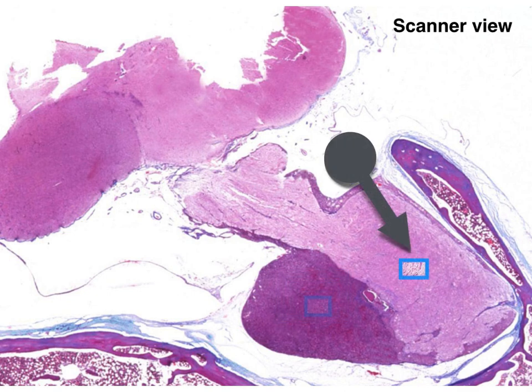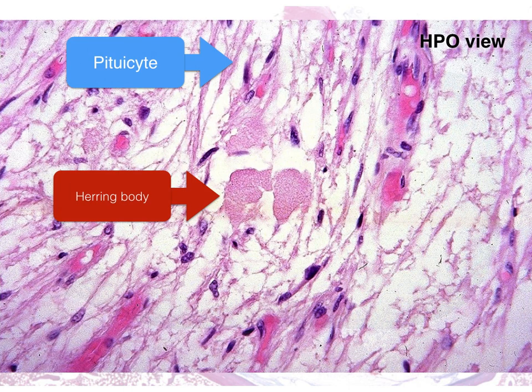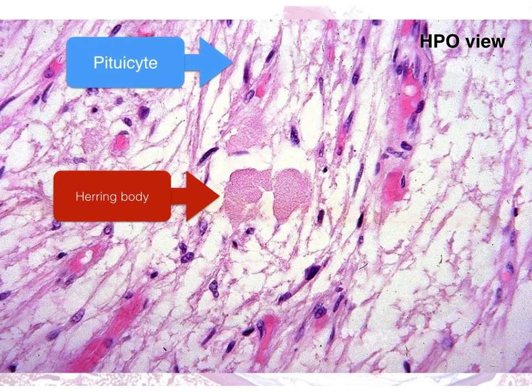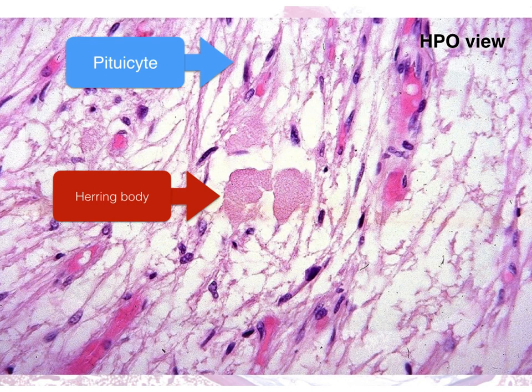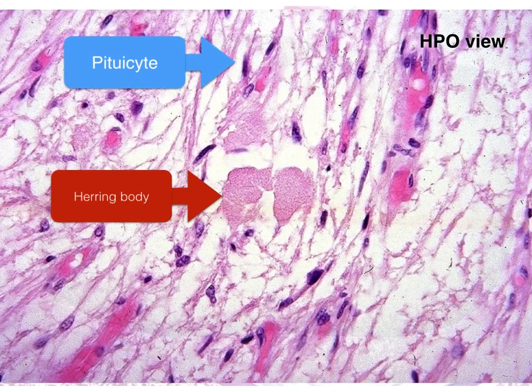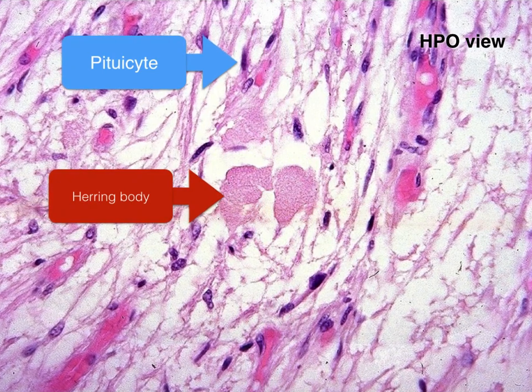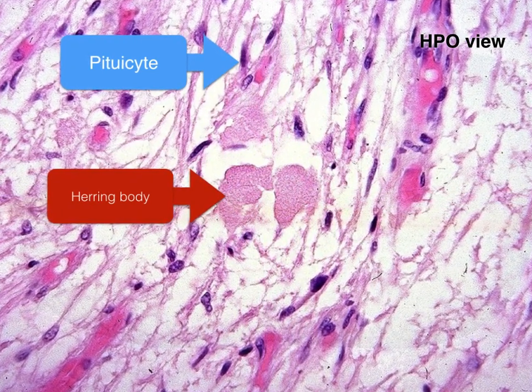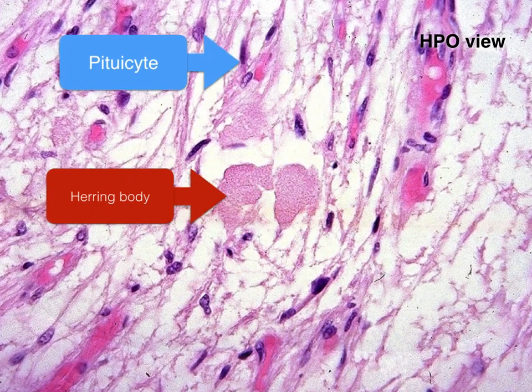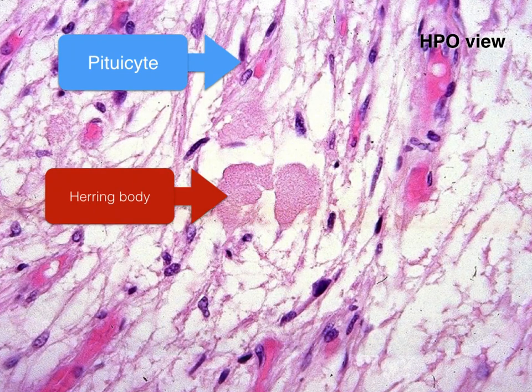Now let's focus on the posterior pituitary, or the pars nervosa. The posterior pituitary resembles unmyelinated nervous tissue. It is composed of the nerve cell terminals that run down from neurons whose cell bodies are located in the hypothalamus. Shown by the red arrow is the herring body. They are distensions of the axon terminal fibers where neurosecretory granules have accumulated. The nuclei visible in this slide, as shown by the blue arrow, belong to supporting cells known as pituitocytes.